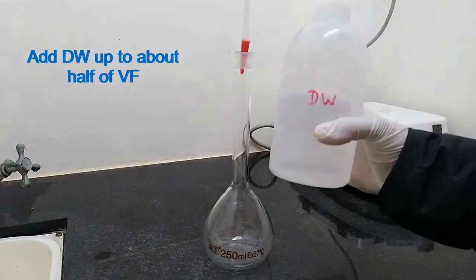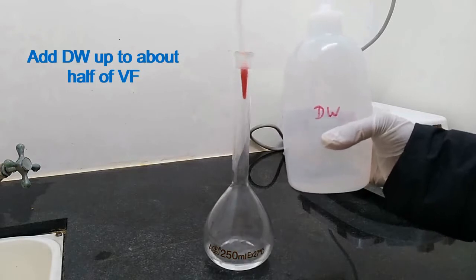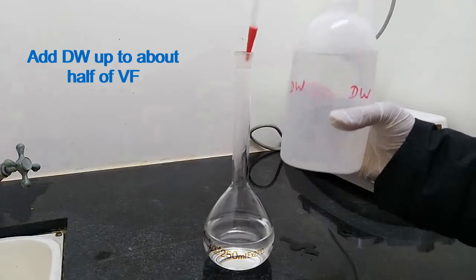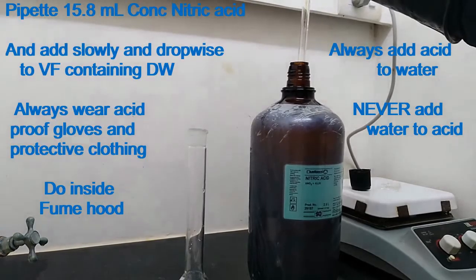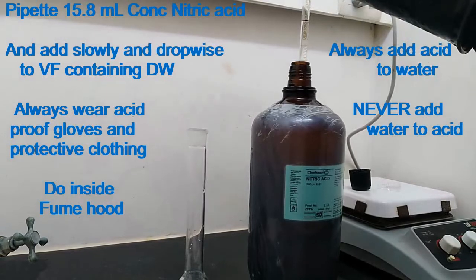Take a clean and dry 250 ml volumetric flask. Add distilled water up to about half of the volumetric flask. Measure 15.8 ml of concentrated nitric acid and add slowly and dropwise into the volumetric flask containing distilled water.